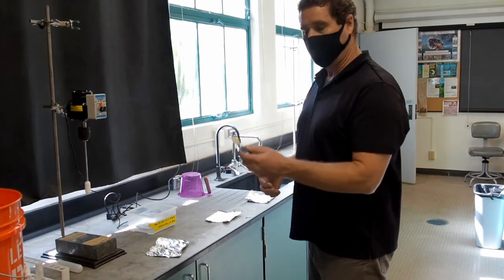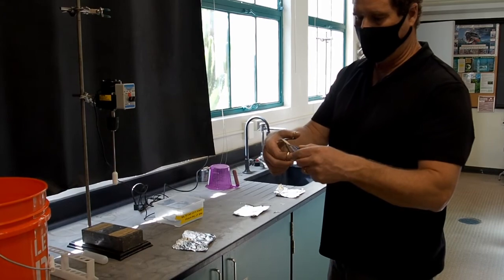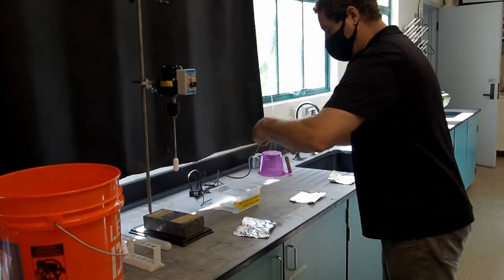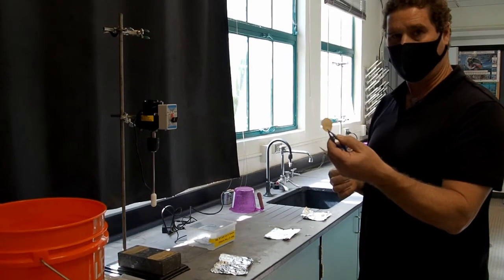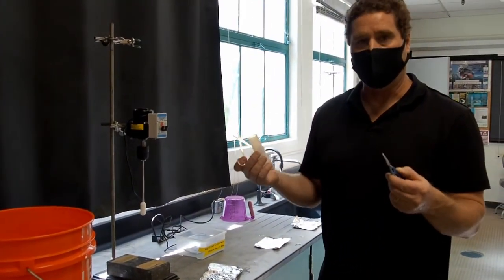So here's our filter once again, and what I'm doing is cutting away the outer part of the filter that doesn't have any sample on it. What we're going to try to do with this is dissolve away the glass fiber part of this and retain just the chlorophyll that's on here. And so to do that, we're going to actually use acetone as our solvent.